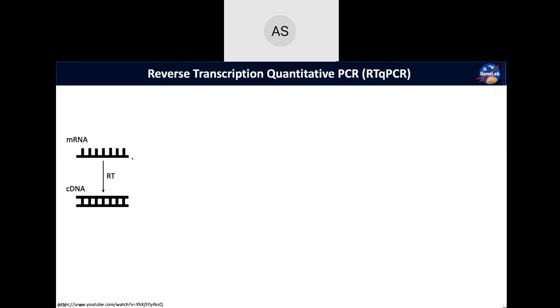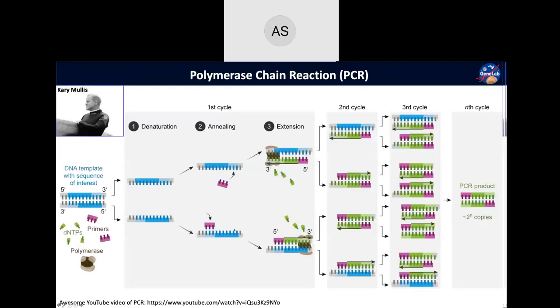Good question. So what happens in this reverse transcription step is you're going to give it similar things to what we gave the PCR with the DNA. Let me go back to here. So think about this: instead of having double-stranded DNA here, we're going to start with just mRNA, which, as you mentioned, is single-stranded. But then we're also going to be adding our primers. They're actually random primers when you do reverse transcription, because you don't want to introduce any bias, since you want to convert all of your mRNA into DNA so you don't miss anything.